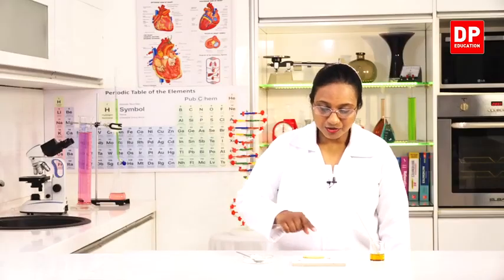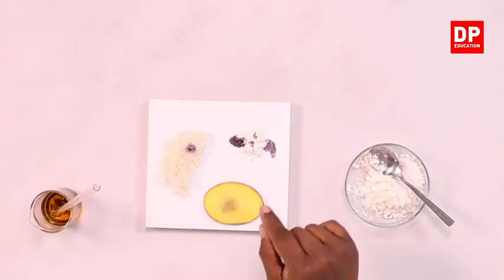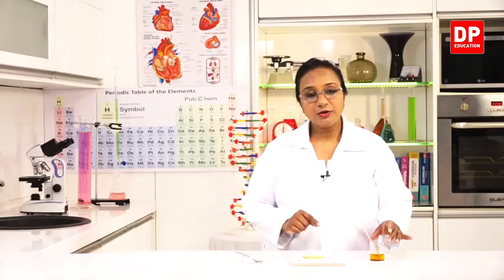So students, you can observe all the 3 samples. Observe clearly the color that has appeared, a very dark purple color. This confirms the presence of starch in the food sample. So when you use iodine solution, the reddish brown color of the iodine solution should become a purple color. That will confirm the presence of starch.